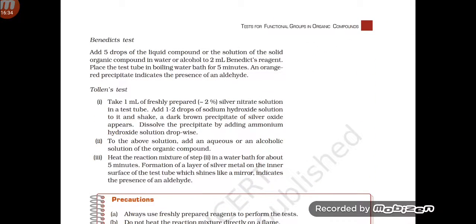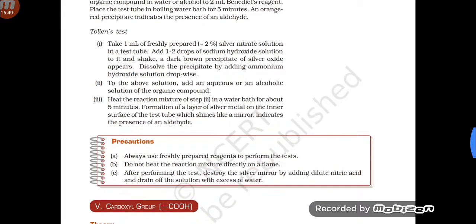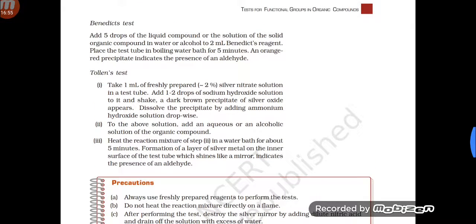And then the Benedict's test, I think it should be given only by the aliphatic aldehydes. So this was the Benedict's test.